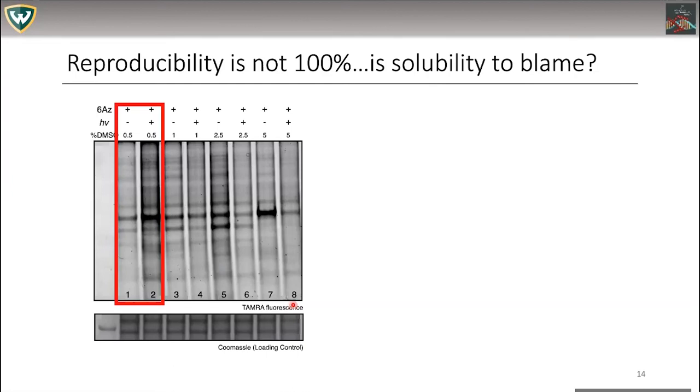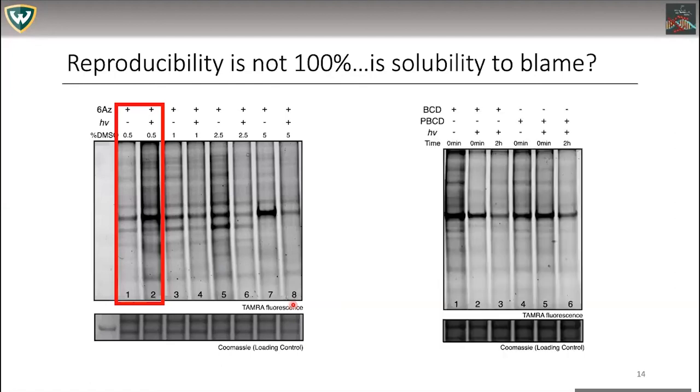So I scoured the building to find any labs that had any cyclodextrin that we could try, because it will help solubilize nonpolar compounds. I attempted to use the beta cyclodextrin and the poly beta cyclodextrin in an experiment to maybe help complex with the sugar to keep it in solution a bit longer, so we could get the results we're looking for. After some more reading, I noticed that beta cyclodextrin and poly beta cyclodextrin are not the best compounds for this choice. I've recently gotten my hands on some other cyclodextrins that are a bit more soluble in media, so that's next on my to-do list.